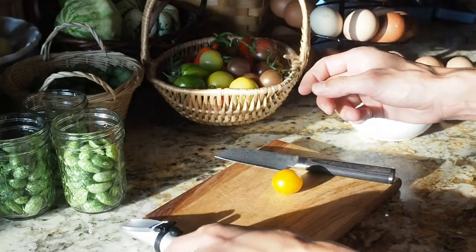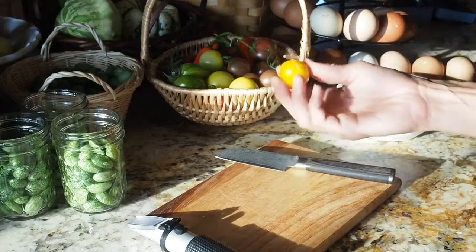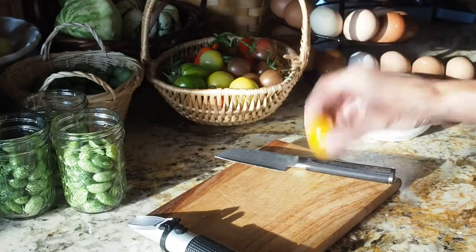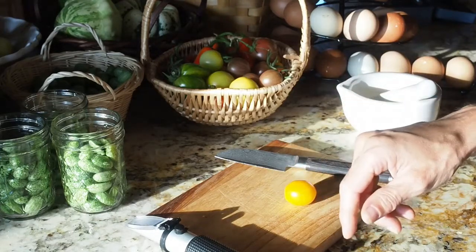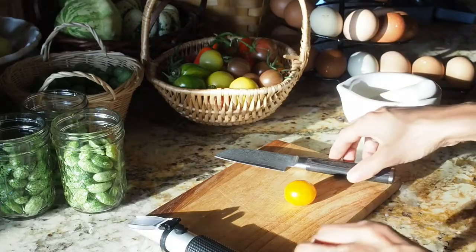I've already done that for 7 of my cherry tomatoes and I have one left that I'm going to do right now. This is the golden nugget, so we'll see how that compares to my other tomatoes. The black cherry is the one that had the highest Brix level of the ones that I've done so far.